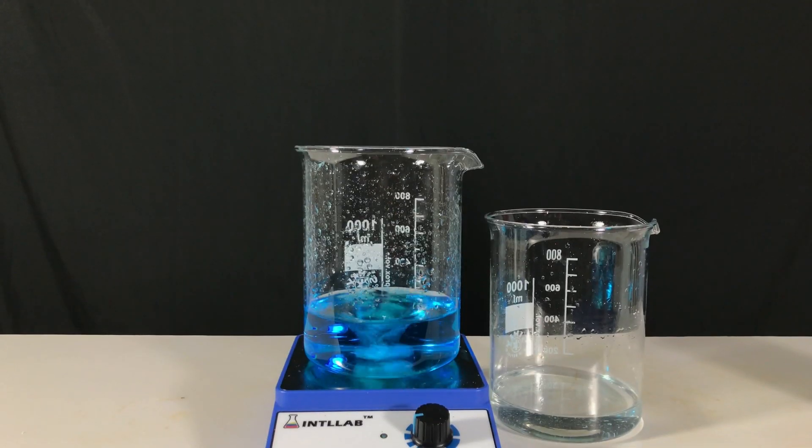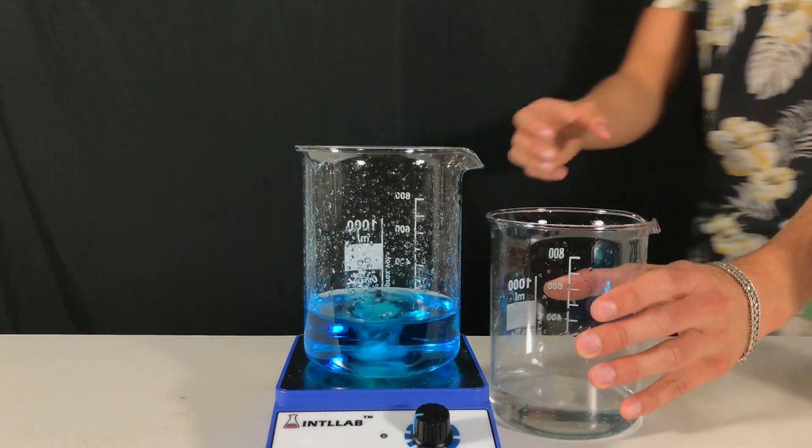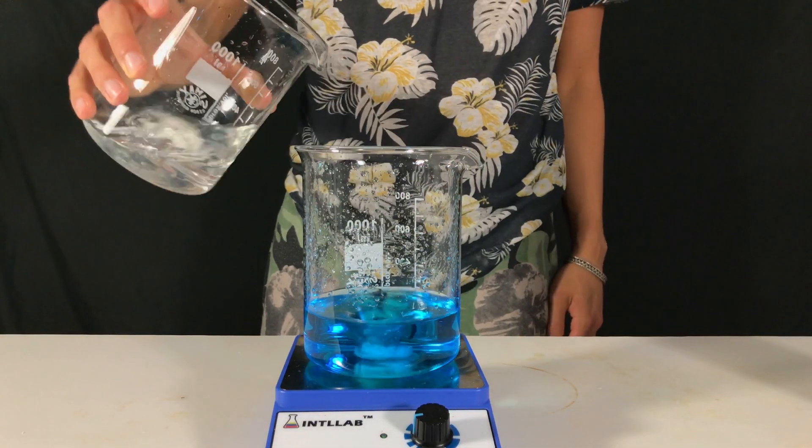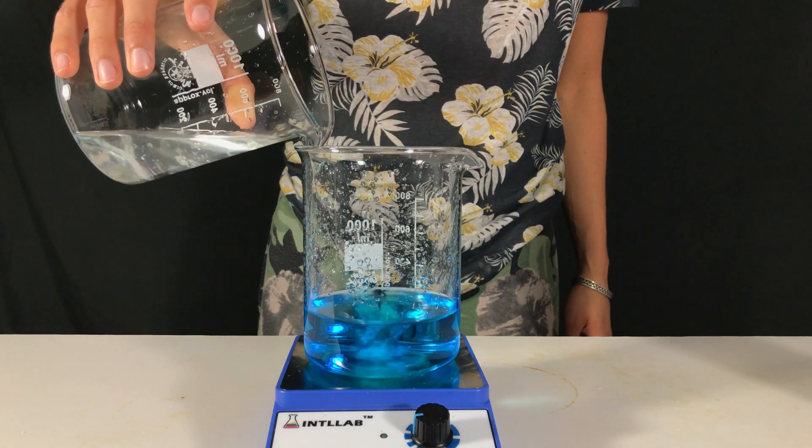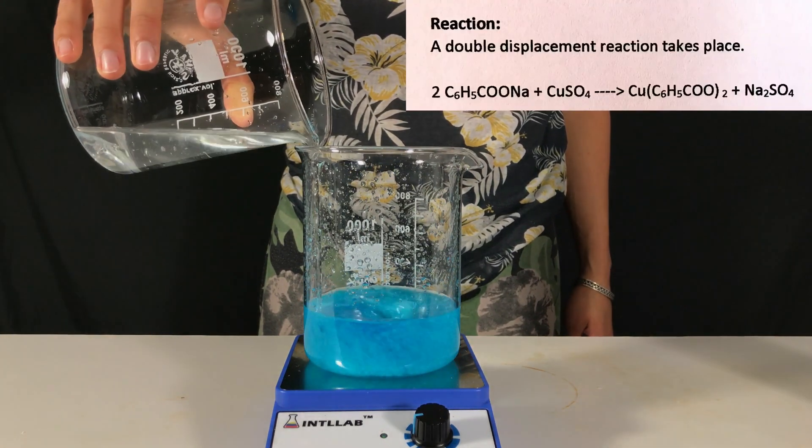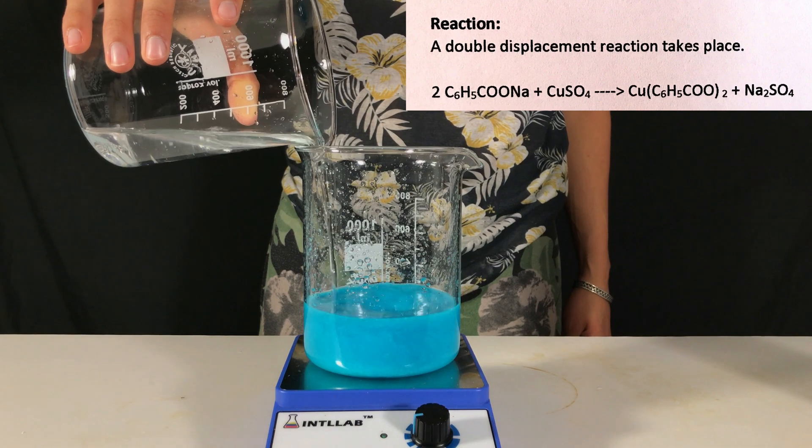When both of the chemicals have completely dissolved we take the beaker with the sodium benzoate solution and slowly add it to the copper sulfate. A double displacement reaction is taking place.